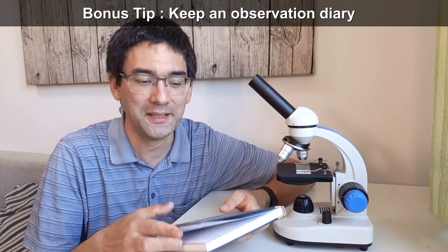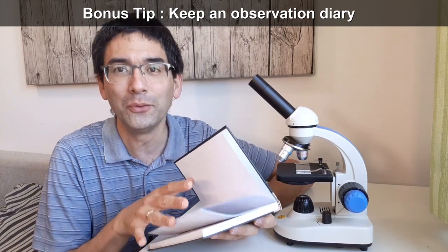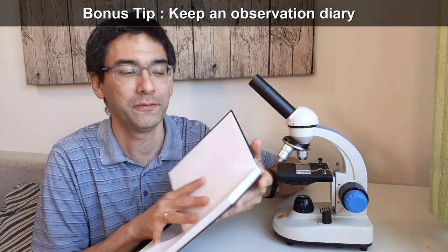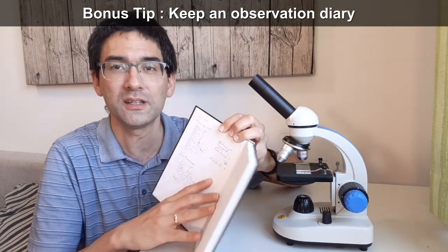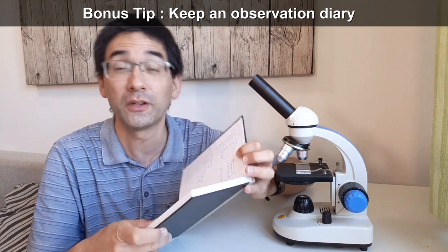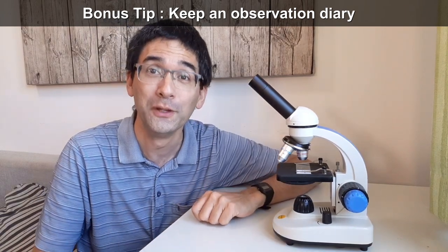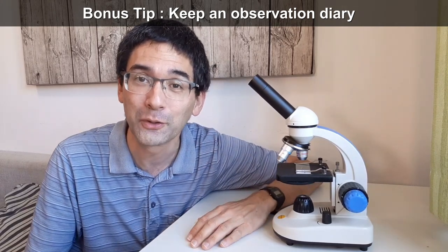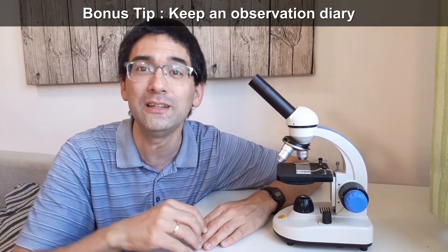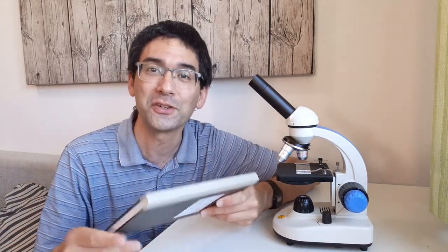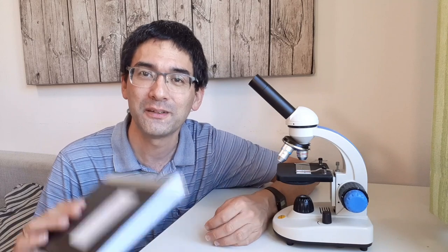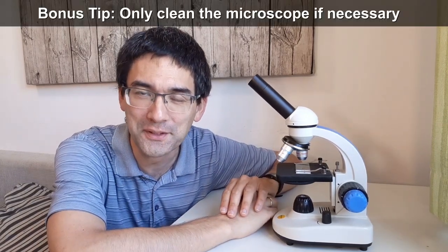And I think I'm just going to give you also a bonus tip. Do write down what you're observing, keep a diary. I've done this here as well. I've just put a little data into the notebook and then I simply have written down what I observed. If you want to, you can also take pictures using a mobile phone, then you can upload the picture into the computer and print it out and maybe stick the printout into your notebook. But do keep some kind of a written diary because I think that's a very nice way of actually also remembering all of the things that you've actually looked at under the microscope.